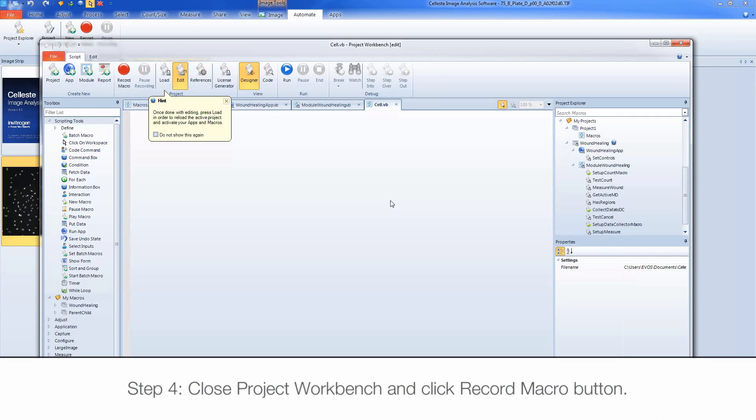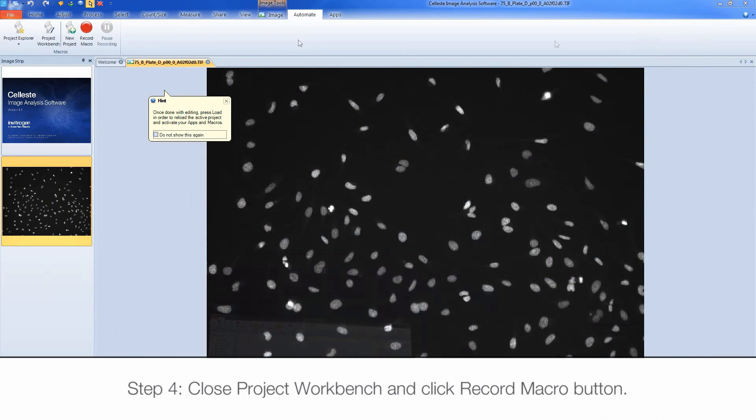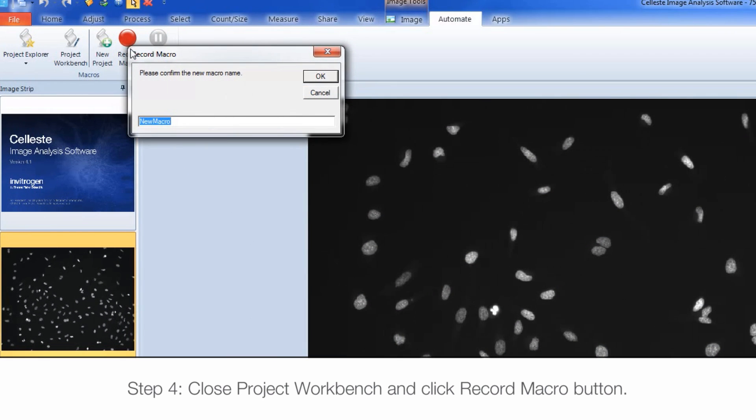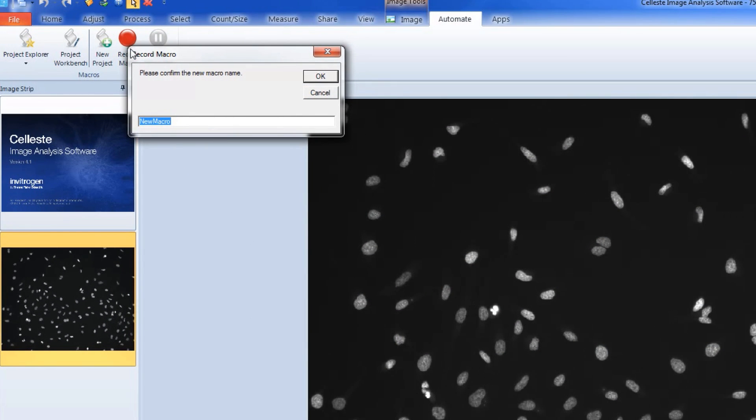Close or minimize the project workbench that will open automatically after creating the new project and click Record Macro. Enter the name of your macro and click OK when done.